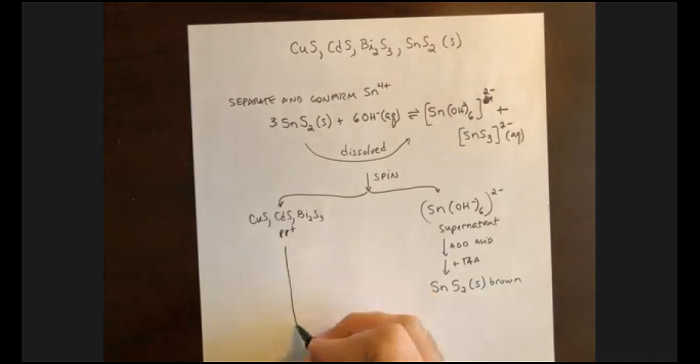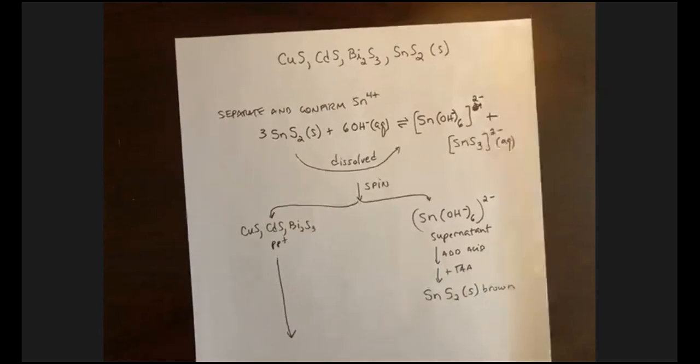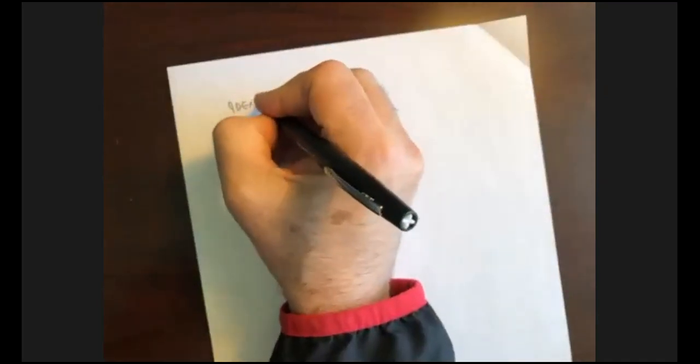Okay, now we have these guys here, and we need to continue separating these guys, all right? So let's go and see what we're going to do with those. Let's see how we are going to now identify the presence of cadmium. Identify cadmium.